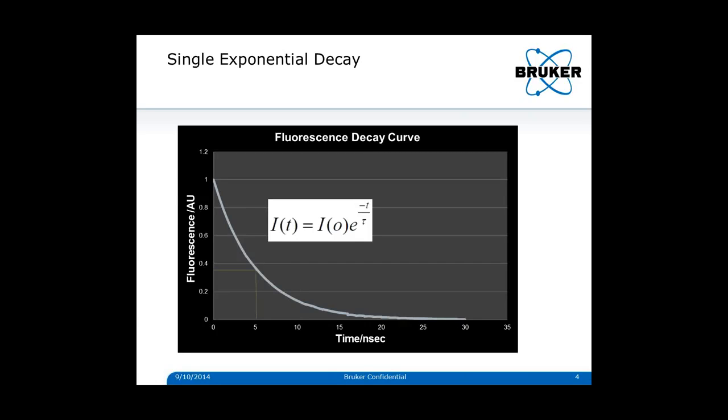And we will talk about that in a little bit, but before that I would like to show you this exponential decay graph. Like I said a little while ago, to get the lifetime you have to have an exponential decay, and this is what this shows. For example, at time t equal to 0 here, you have a large population of molecules, and all these molecules are in their excited state. And these are all similar molecules, they're in the same environment.